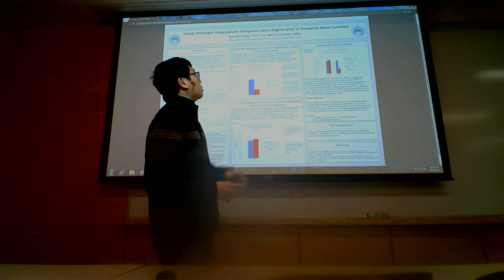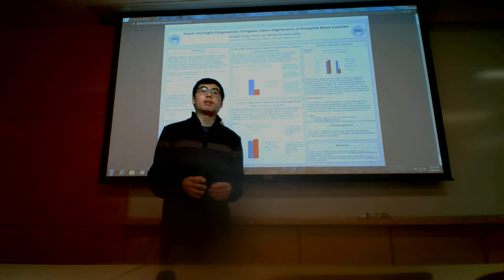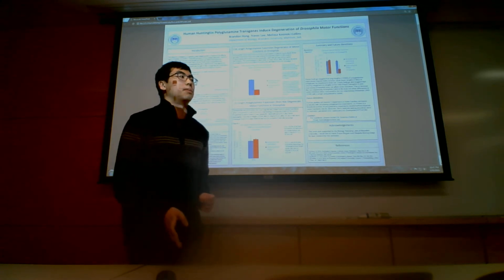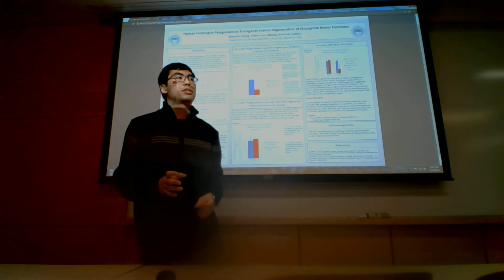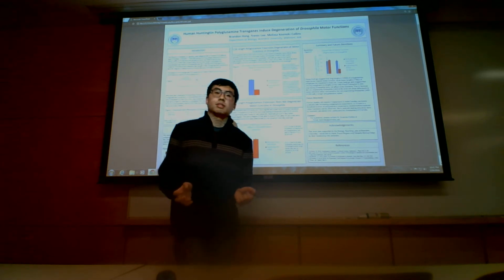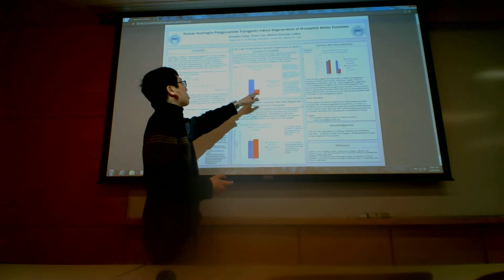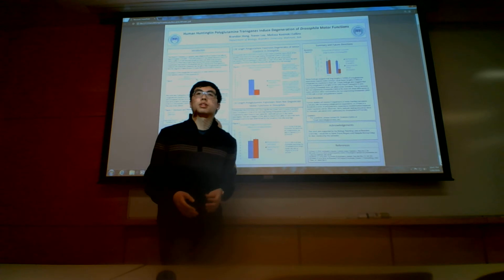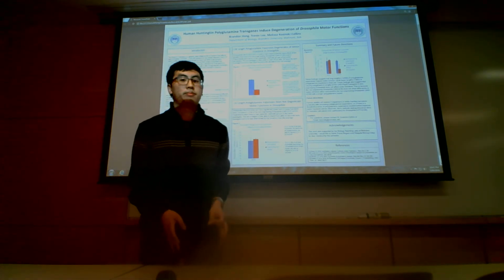In conclusion, you can see that long lengths of polyQ dramatically inhibit the motor functions of Drosophila on the order of about 3 times. And lower lengths of about 16 polyQs do not inhibit the motor functions of Drosophila at all. Now, for future directions, we would of course like to do more replicate testing on the Drosophila expressing HTT 128 polyQ.